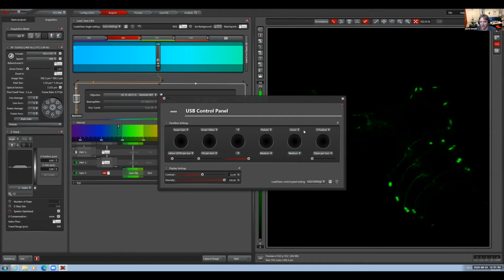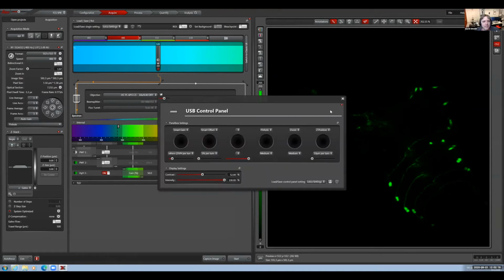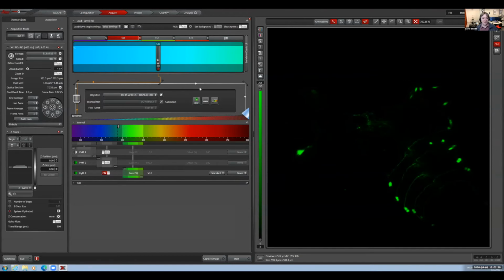So if you want to program them to anything different, there is one that's not programmed to anything right now. If you click on that, there's a whole list of various options of what it can be set to. Okay. So we can. That was this thing right here. Yep, that button tucked away behind there. It sort of shows a picture of what that control panel looks like.